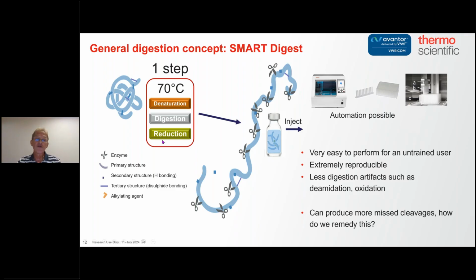And we can also do the reduction at the same time. Now, that can cause problems, which we'll look at now, because that reduction will start to break the trypsin up. Even though the trypsin's heat stable, under those reductive conditions, the trypsin's only going to last about 15 minutes. Now, because it's on a magnetic bead, you can automate that. That's an example of a KingFisher. It's about the size of an inkjet printer, but it allows you to automate and move those magnetic beads around.